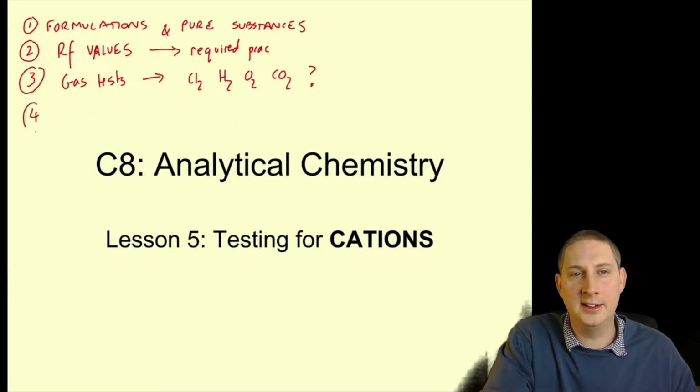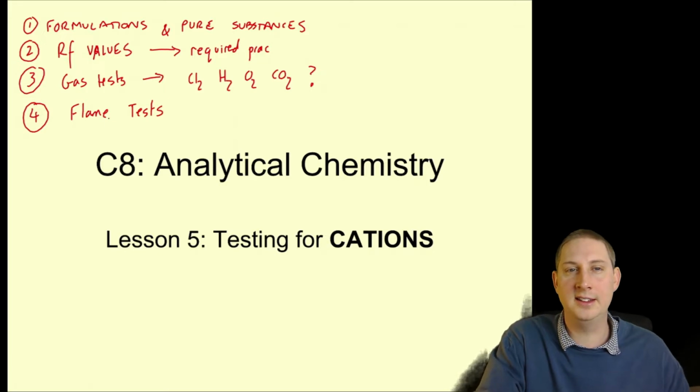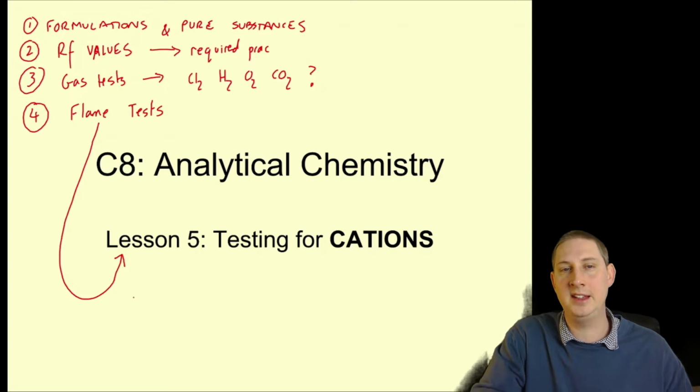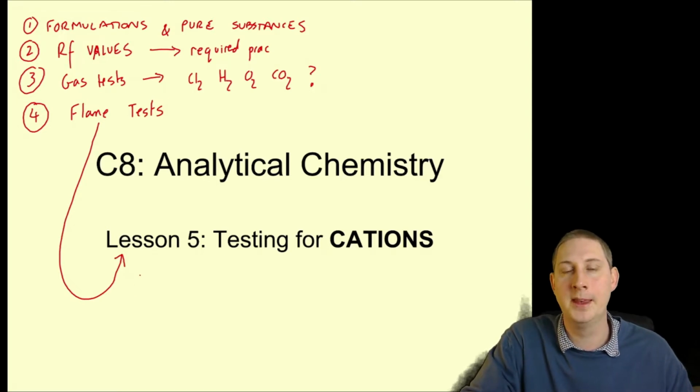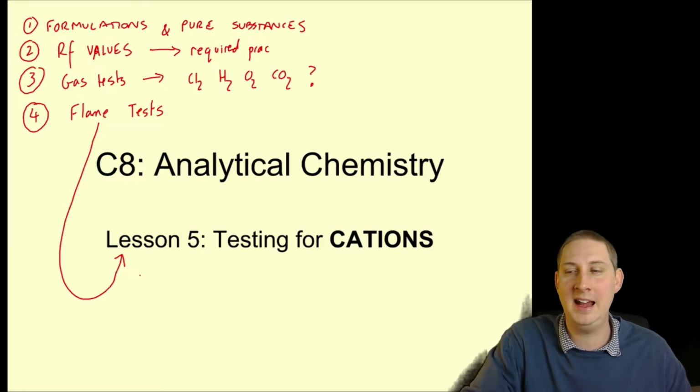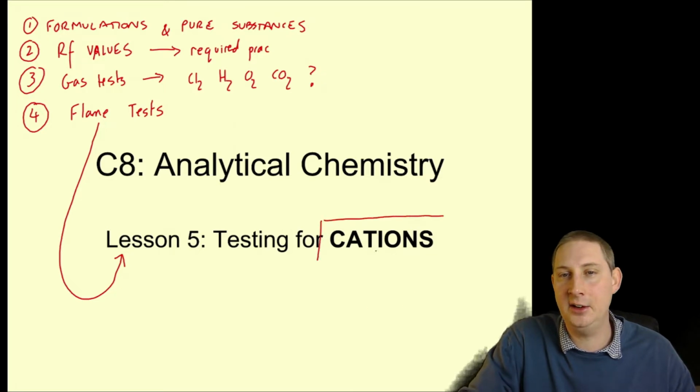And the fourth lesson is flame tests. Now, Miss Watt's classes haven't had the chance to do that, so I'm actually including that in this lesson here, flame tests. So for my set there's a little bit of a recap, but given that you did it the last lesson before Christmas, I'm not sure how much attention you were paying. Anyway, for Miss Watt's set all of this will be new. But the theme of today is testing for cations.